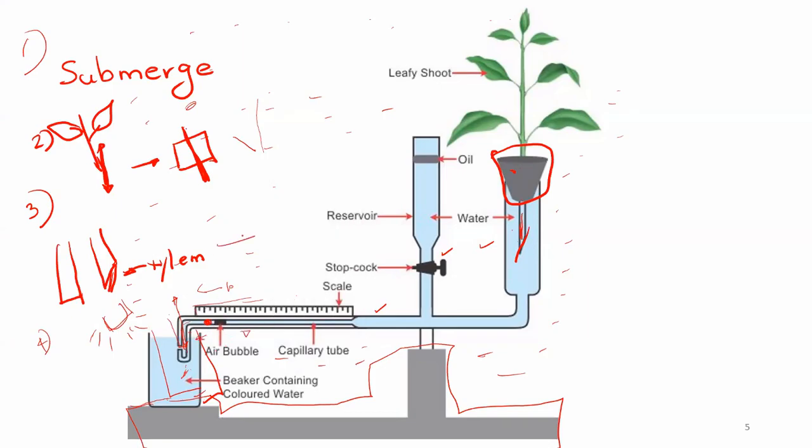This or this? A, B. Which direction? A direction. Yes, why? Because when transpiring, the plant, the stem absorbs water. Yes, in here, good. In here, the transpiration occurs.